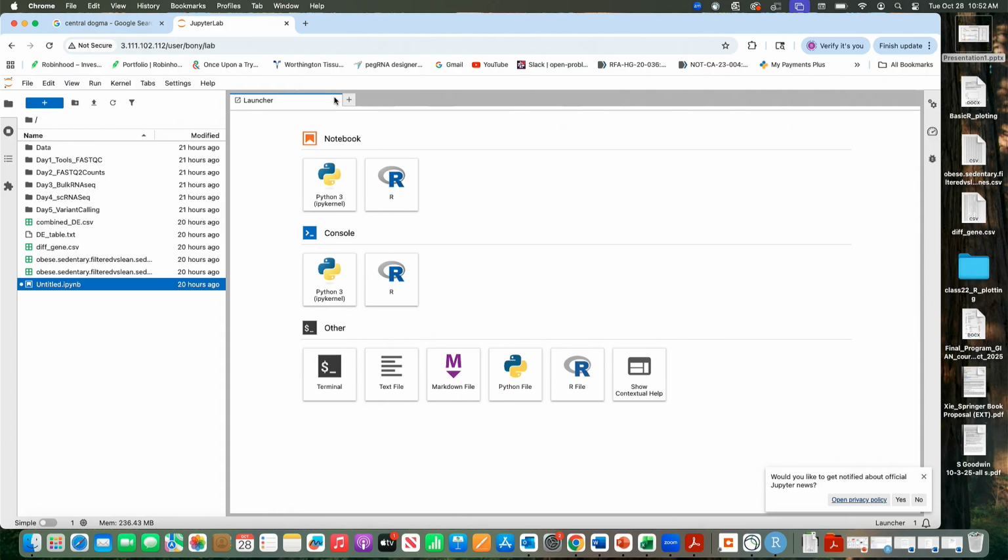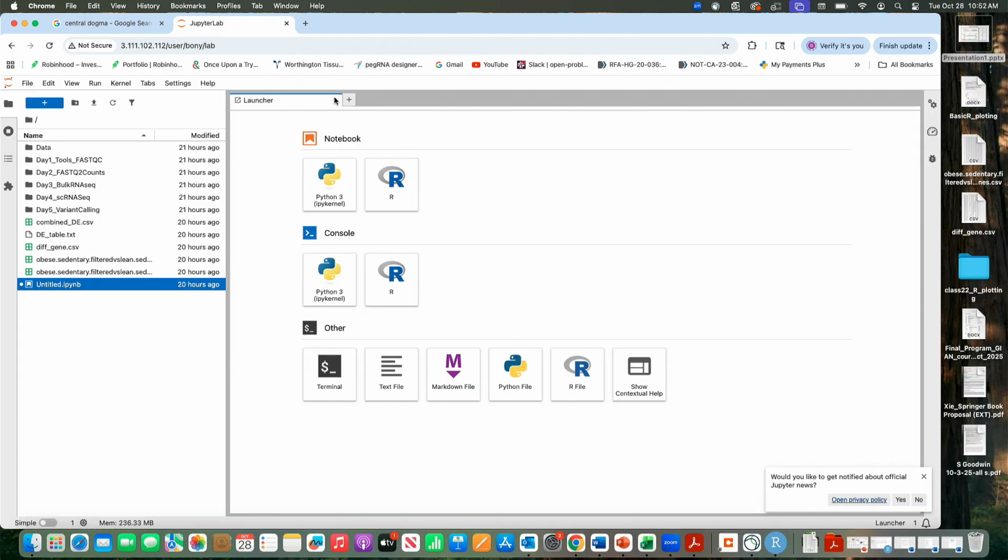So we are going to use this Jupyter notebook slightly differently. The only reason is that, for two reasons: one, I was a bit lazy to make a notebook, and second, I was also a little bit busy too. But anyway, both things, so we will make that notebook.